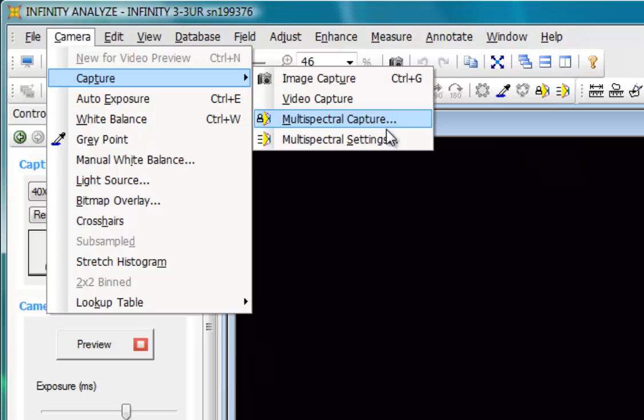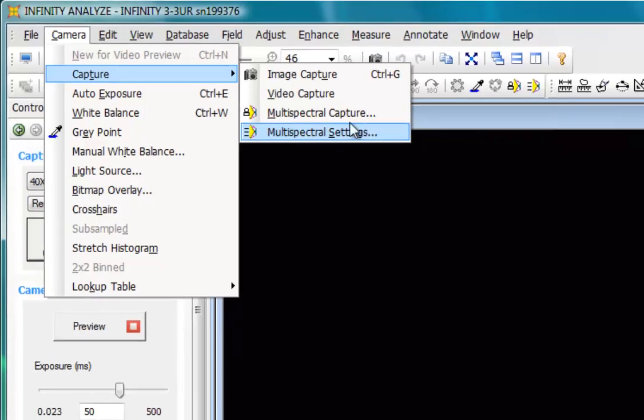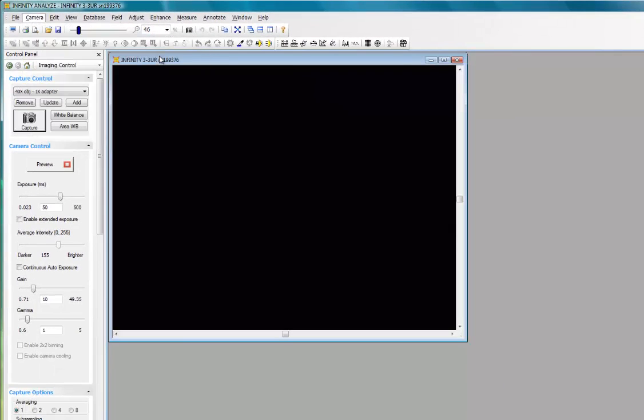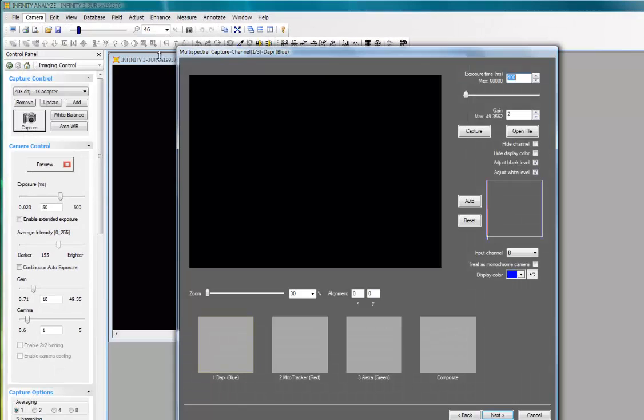Refer to the video tutorial on how to configure your Multispectral settings before proceeding. This is a process that's done infrequently, but you would need to be familiar with the Multispectral settings as it controls the channels used for your Multispectral acquisition. I'm now going to click the Multispectral Capture to bring up the wizard.